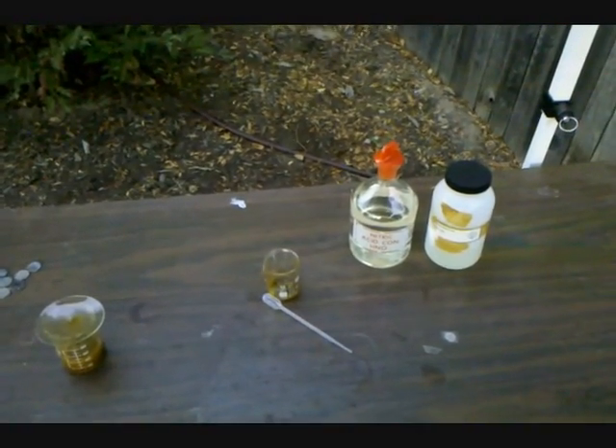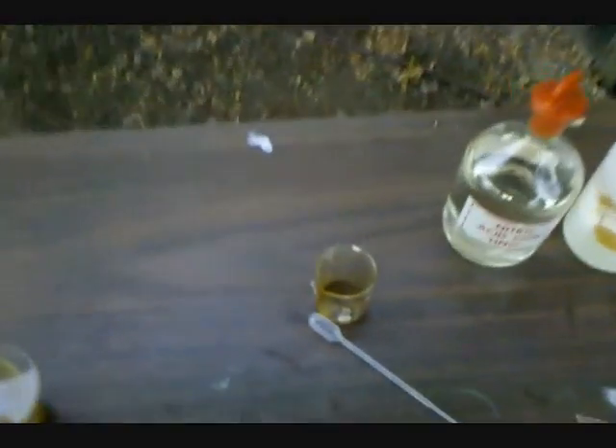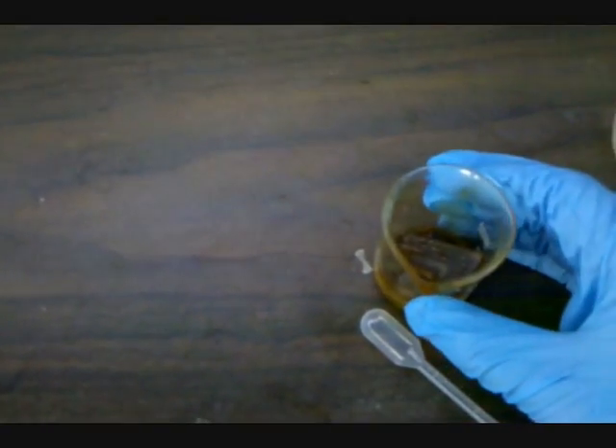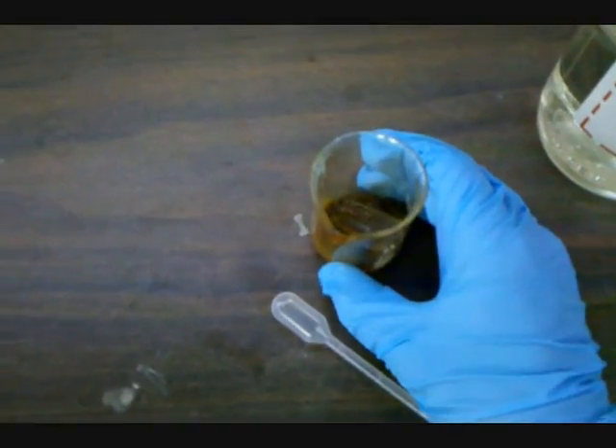Hey everyone, in this video I'm going to be showing how to recycle gold from old computer parts. The computer part I'm going to be using is an old CPU that I found in a computer from a local elementary school that was in a dumpster.